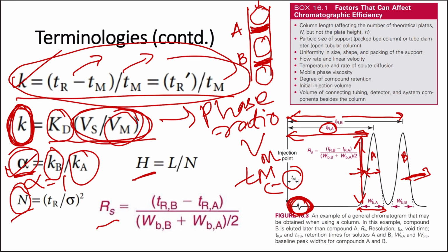They are in equilibrium between the stationary and the mobile phase, so they go along with the mobile phase because it is flowing. In this case we can say the plate number N is equal to 3, because these are the areas where there is no formation of bands of the analytes. That is what we call N, the total number of theoretical plates. The size of the plate can vary, and we calculate it based on a theoretical assumption, so it is a hypothetical quantity.